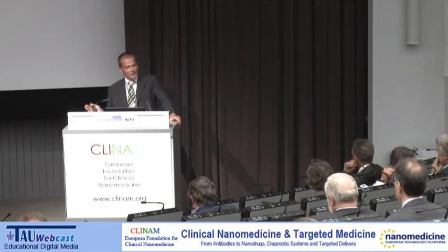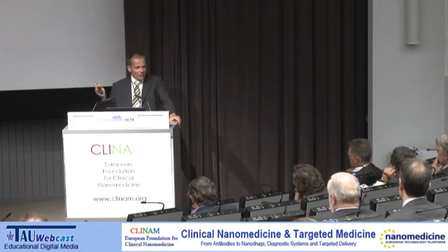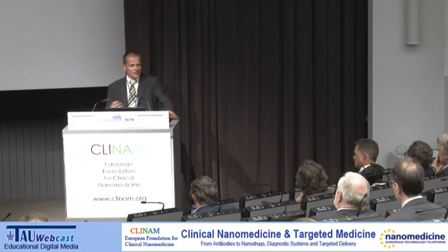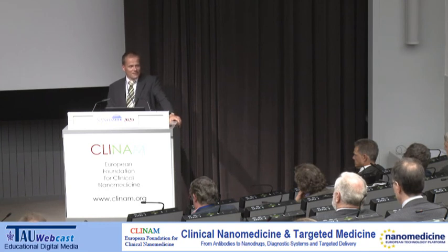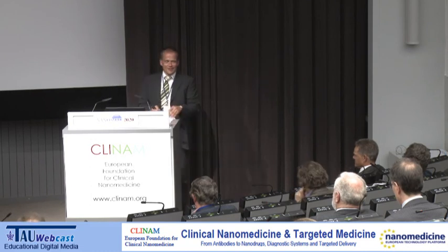Then, in other cases, we are only interested in this for the reason of tox profiling, where we clearly know a nano suspension, for what reason ever, is perhaps not possible for a human application. So there's different cases, but in the early stages of the formulation development, we try to cover both aspects there. And yeah, there we clearly have more in vivo data. That's why I presented such examples there.